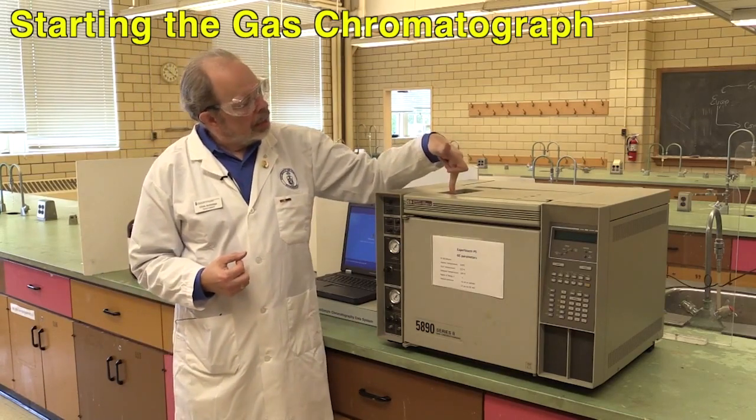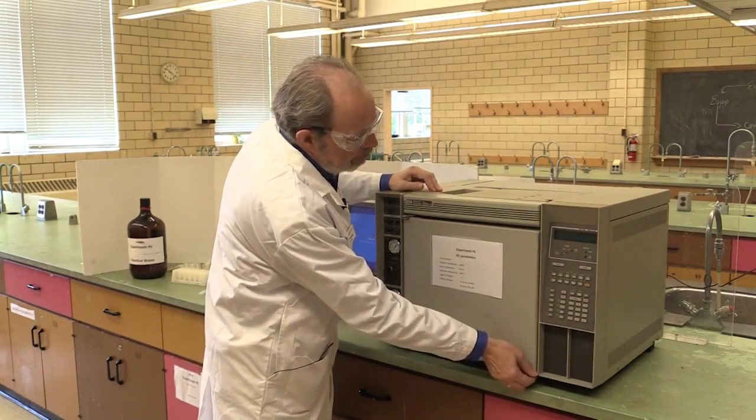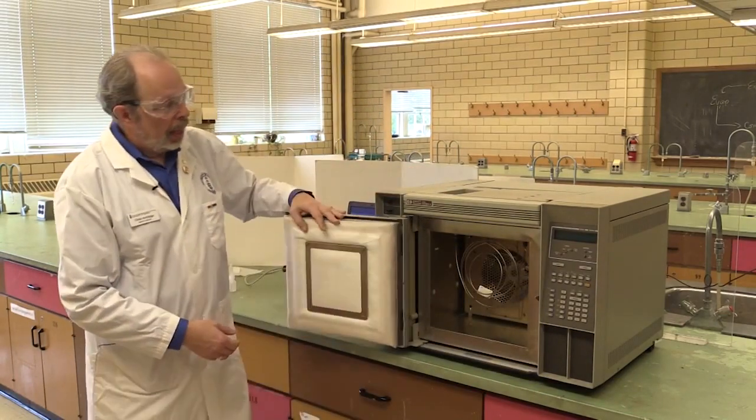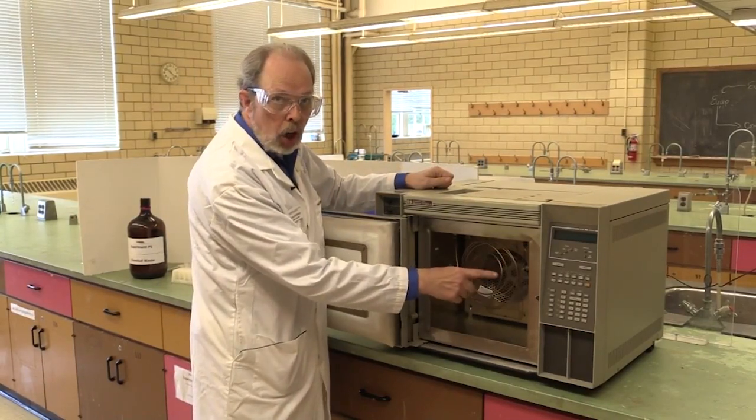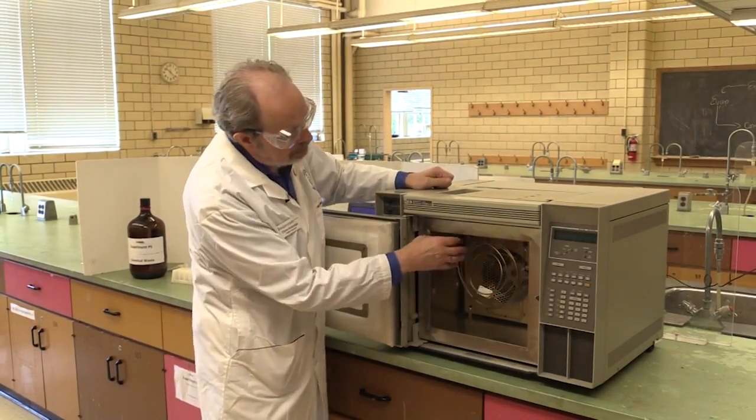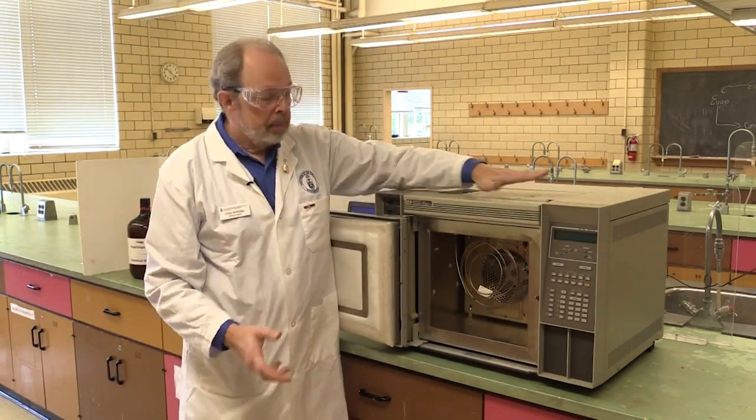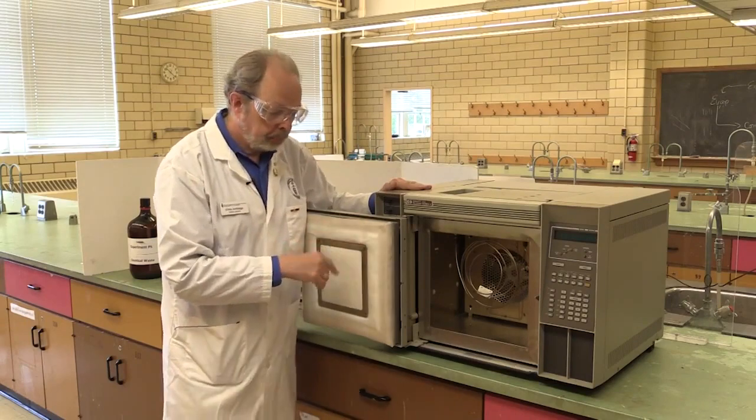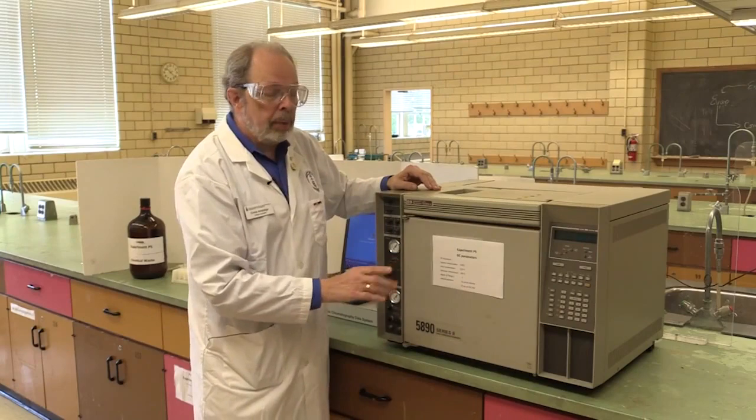The machine injects your sample here, and inside we have an oven. You inject your sample. It goes in and around the column, and in the column the separation actually takes place. At the end of the column it goes up here, and there is a detector underneath. Now, you need to have all this at appropriate temperatures, so we will set that right now.